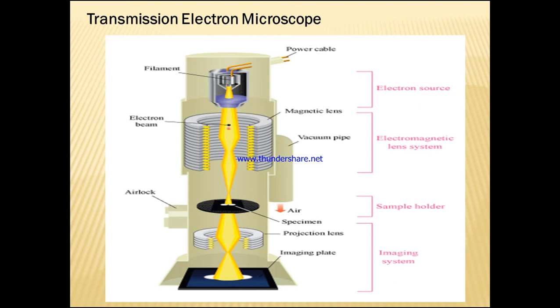Because of this, TEM as well as SEM. When we are using an ultra thin specimen, TEM plays a very important role. When we have thicker samples, more than 100 nanometers, SEM plays a very important role. So SEM and TEM are very important microscopic analysis tools which we use for analysis.